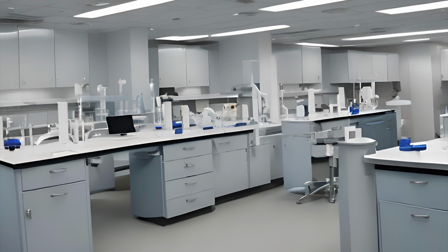Stat may or may not indicate a life-threatening situation. Medical emergency will always indicate a life-threatening situation. So of those two, if you get notified of a medical emergency and you have a stat urine sample so that somebody else can go in for a routine surgery, you will prioritize the medical emergency.